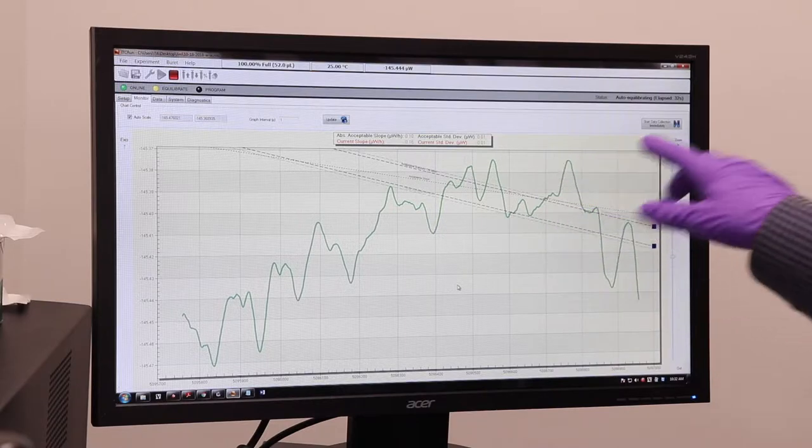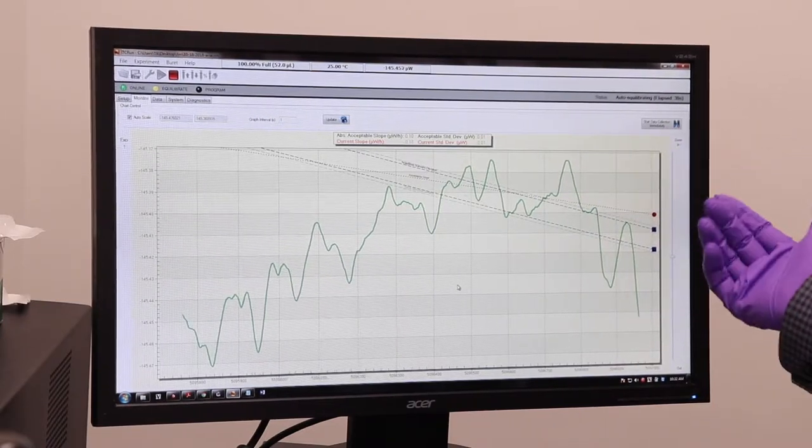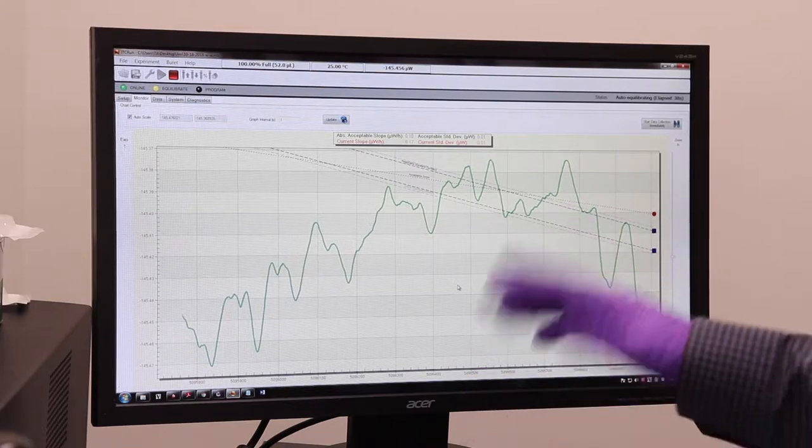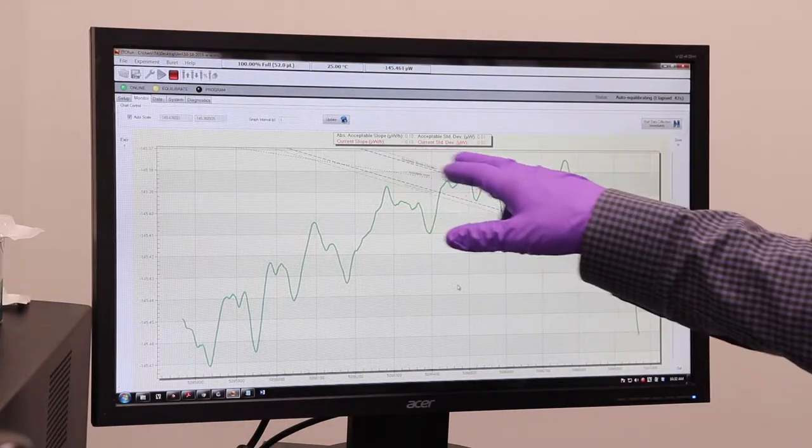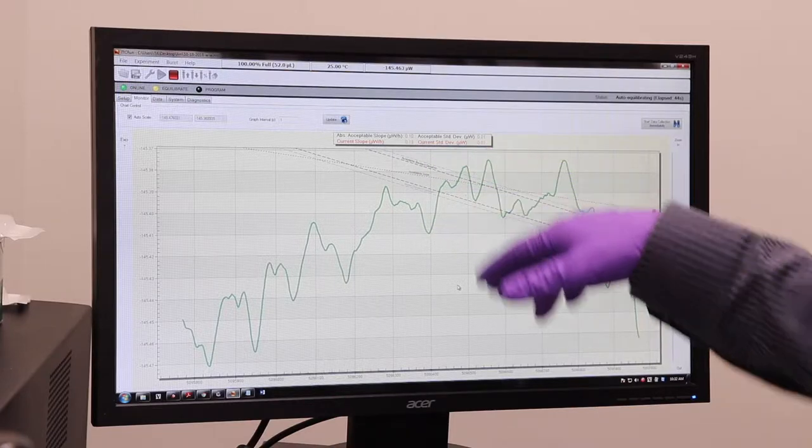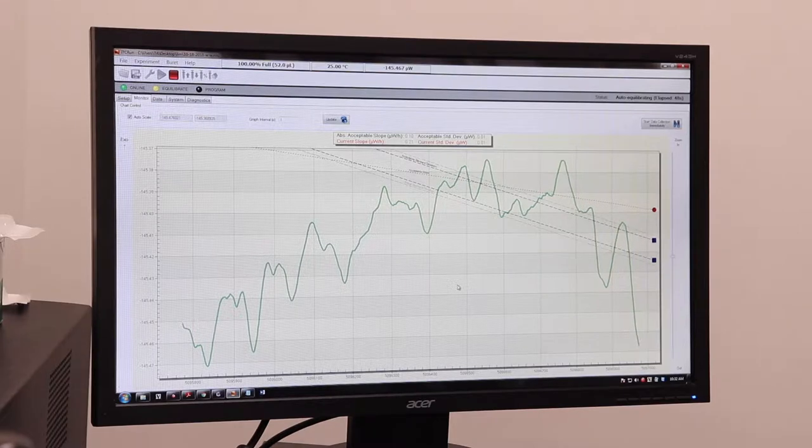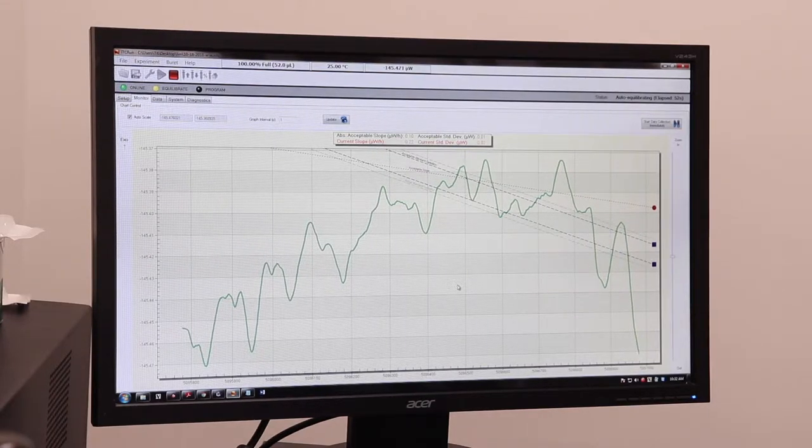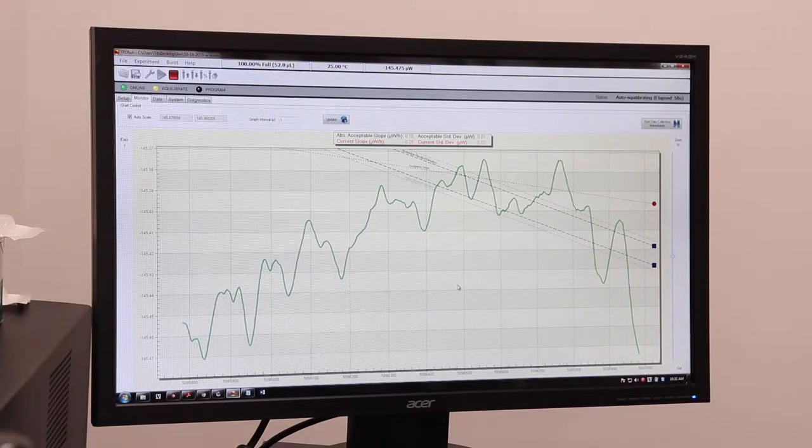So it's going to monitor the slope and the standard deviation until it hits an acceptable value for both of them. And then it's going to start the experiment where it's going to wait 300 seconds and then do the first injection. If you're really impatient, you can just hit this start data collection immediately button here. I would suggest it, but if you want to, you can. So right now we're just going to wait until the slope and the standard deviation looks good. Both of them have to hit. And then it'll start. So depending on your sample, could take 10 minutes, could take an hour. We'll see.